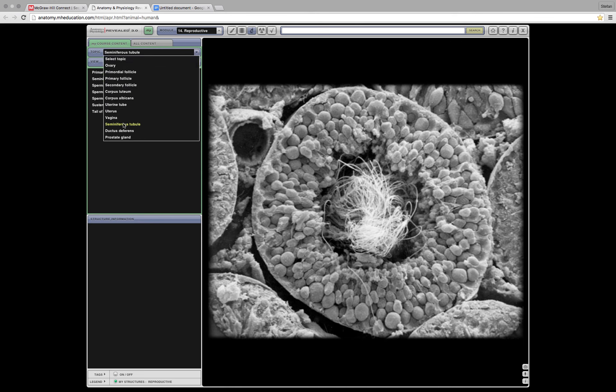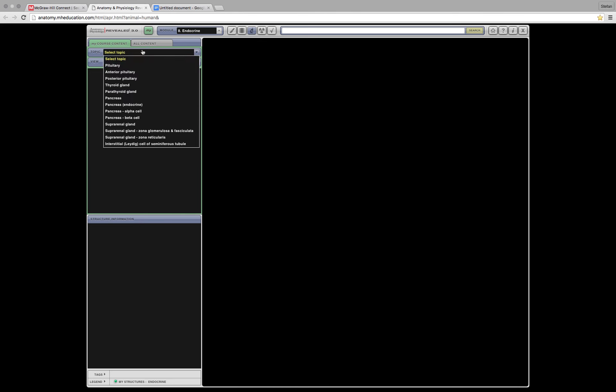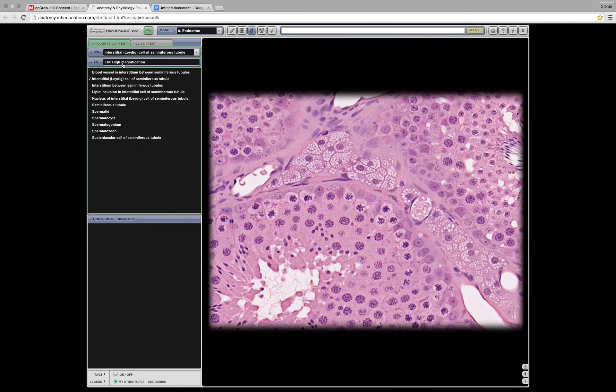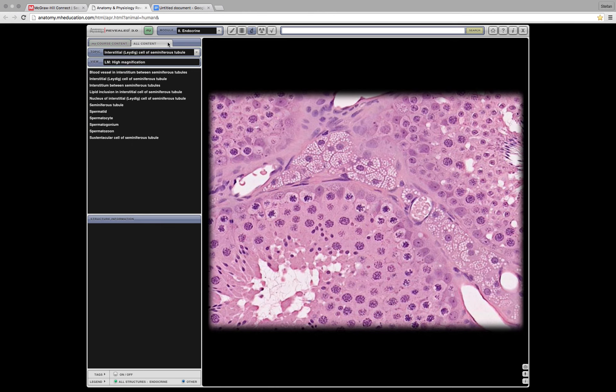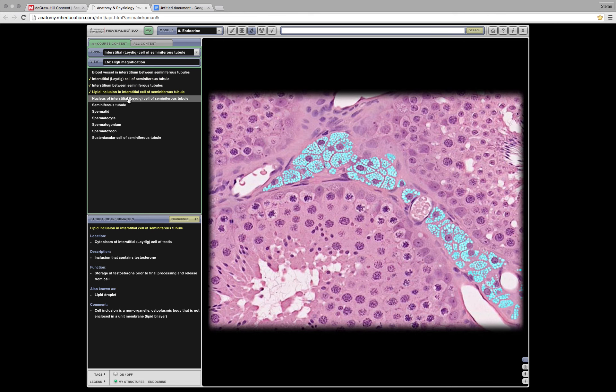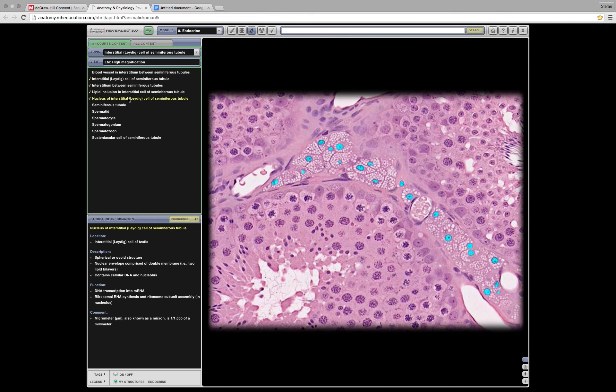Let's go back to endocrine module. Endocrine module. Histology. Topic. Pancreas, parathyroid, posterior, adrenaline. This is good. Can we zoom out a little bit? No, you can't. I wonder. Well, you should look up slides of the testes. All you need to know is, you know what? I'm gonna find it. Damn it. Even if it kills me.